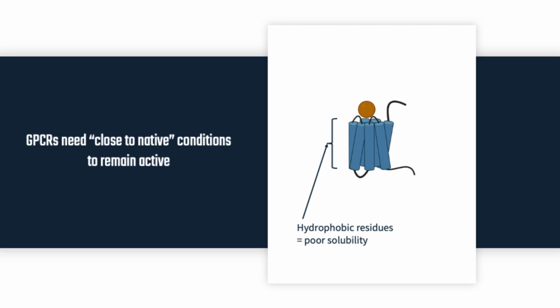Also, this extract can trigger non-specific binding signal. If you look at membrane extract, it's quite a dirty sample. It has a white milky aspect, and there are a lot of different proteins or different stuff in there. So it can also trigger some non-specific signal that can have a major impact on the data analysis itself.